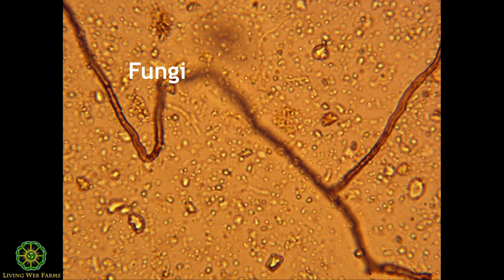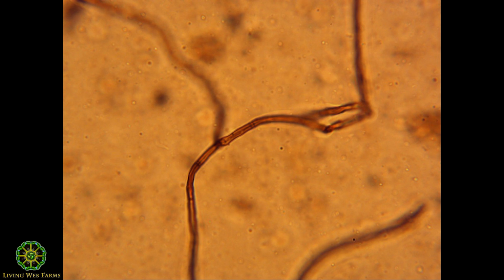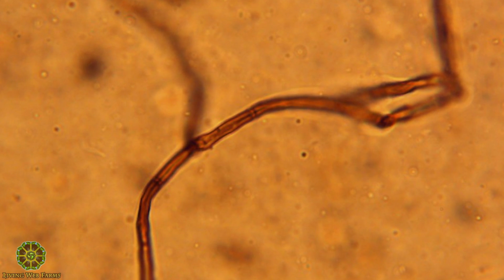But the wider the diameter, the darker in color, and the more uniform the septae, the more beneficial the fungus in general. So if you see something that looks tattered or frayed, but it's a strand, and you don't see septae and it doesn't have uniform cell walls, you're likely looking at a piece of organic matter or plant tissue. You're not looking at a fungus, right? So using those characteristics is how we identify. I think I put that one up so you could see the septa a little bit better. Do you see those little tiny segments between the cells? It's just the end of one cell and the beginning of another one. Fungi are so fascinating. I can't even get enough of them.